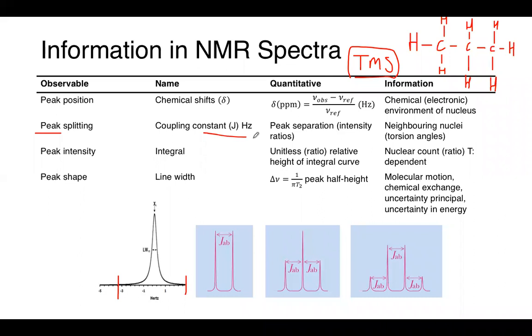That's generally the information we can get from our NMR spectra. And then we, of course, will compare that information to the species that we think we have and confirm whether or not we actually do have it.